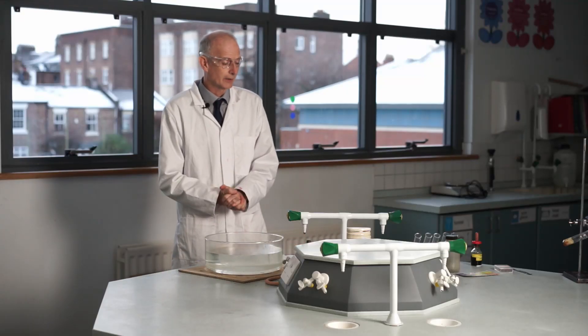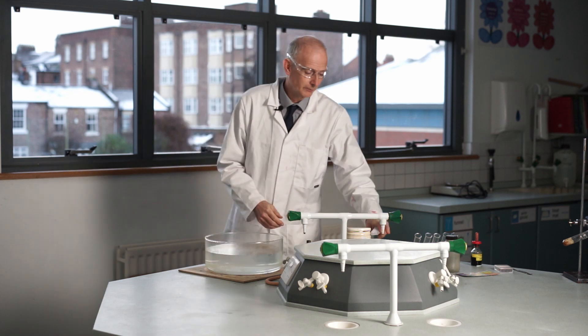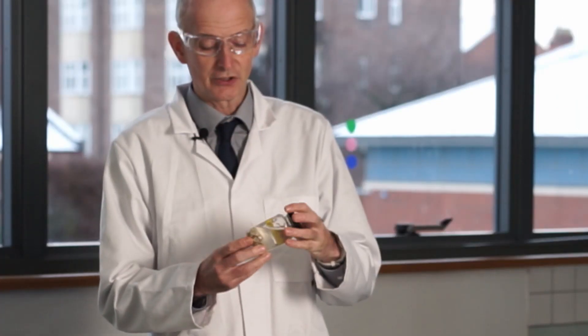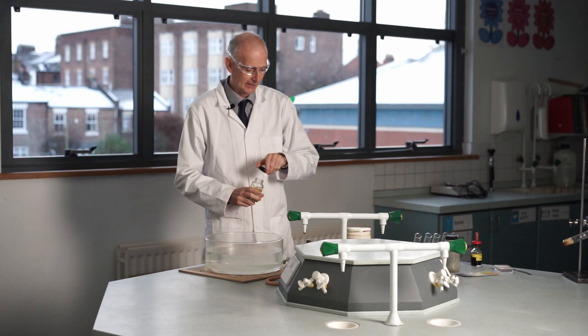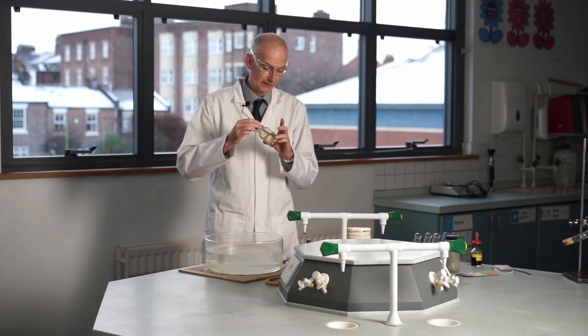This is a reaction of different metals with water. We'll start with sodium metal, which we looked at a few minutes ago. It's stored under oil to keep it away from moisture and air, so the first step is to take the chunk of sodium out of the oil.